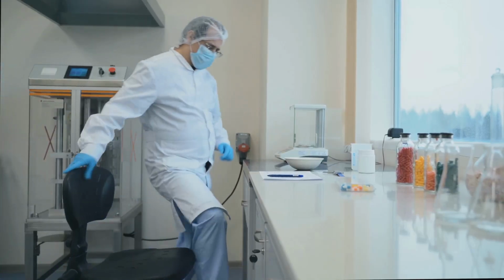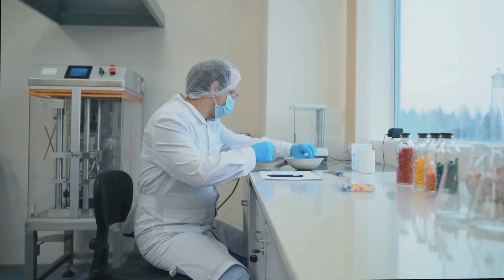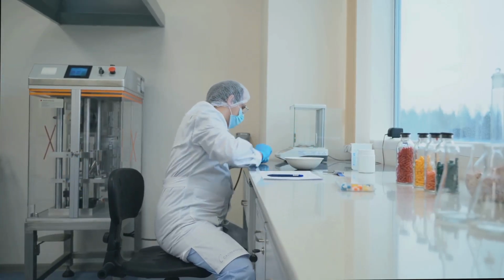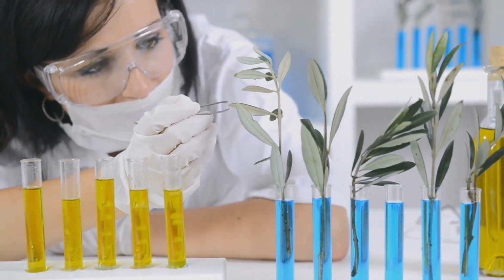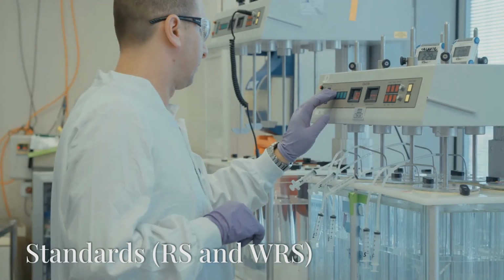High-performance thin-layer chromatography, or HPTLC. This technique separates components based on their interaction with the stationary phase. It's often used for qualitative analysis and purity testing.